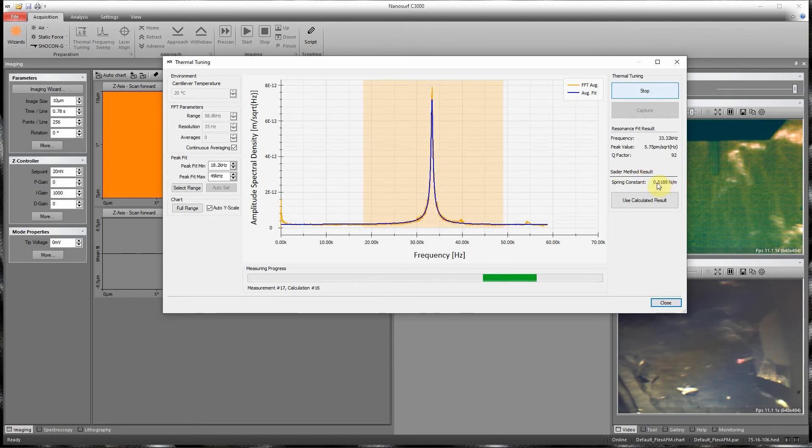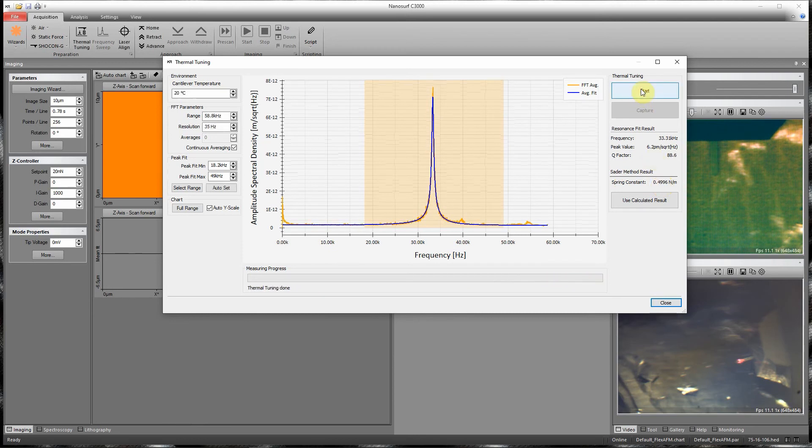Once the spring constant changes are small, we can stop the collection of the thermal data and press 'Use Calculated Result.' Now we see we have a new spring constant set.